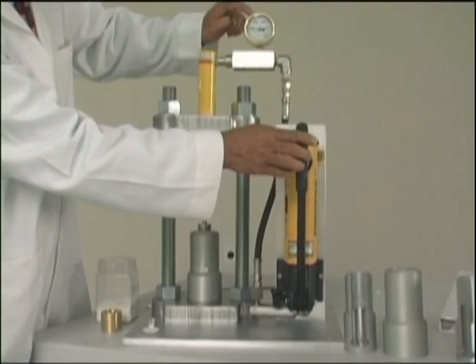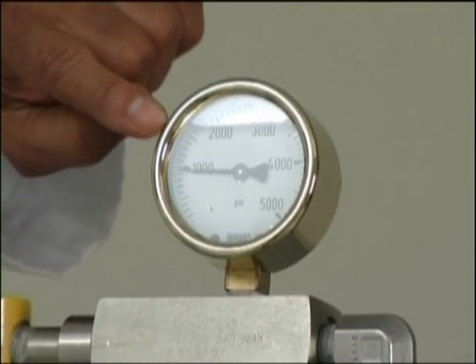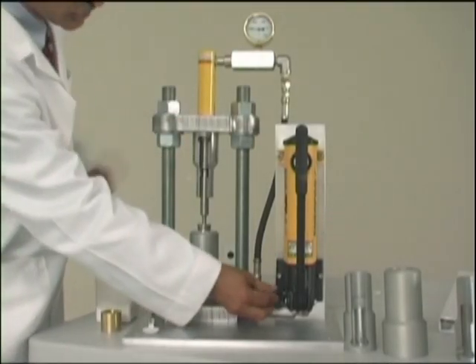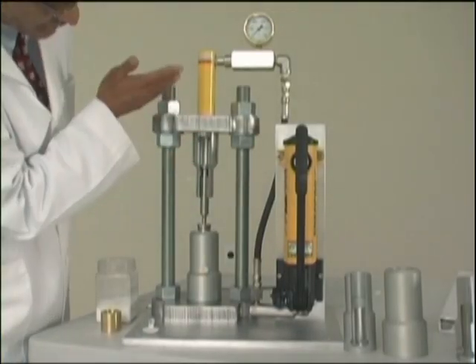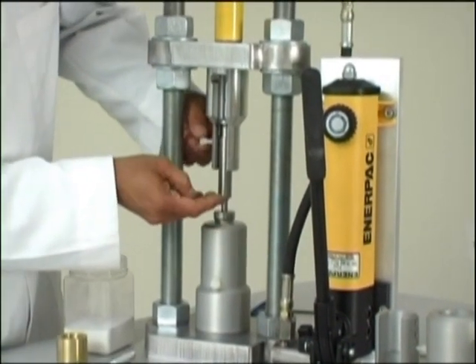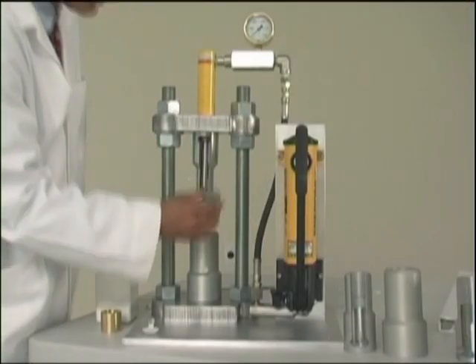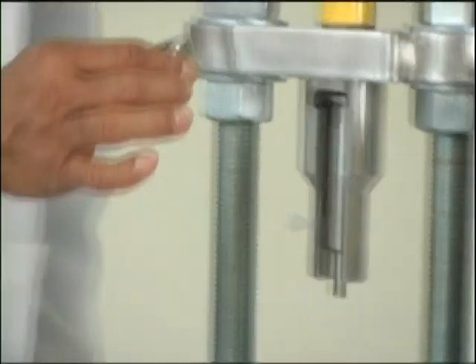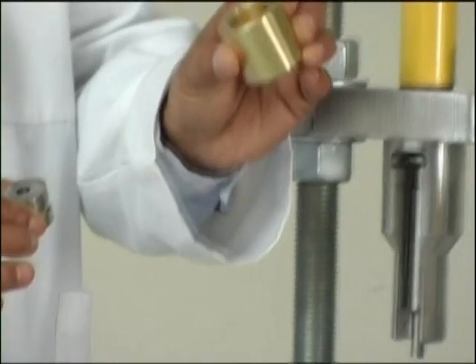Now we can apply pressure by pumping the manual hydraulic pump. You can monitor the pressure applied on the pressure gauge — right now I applied about 1,000 pounds of pressure. Once the compaction is done, you loosen the valve so that the piston retracts, then close the valve back, loosen the nylon screw, and press the upper punch back up. The tablet is now compacted and it is inside the die.